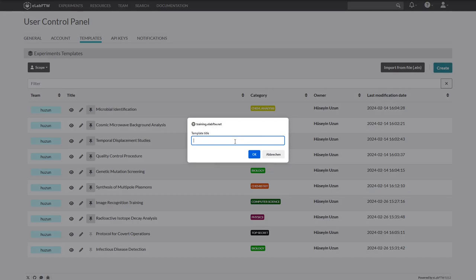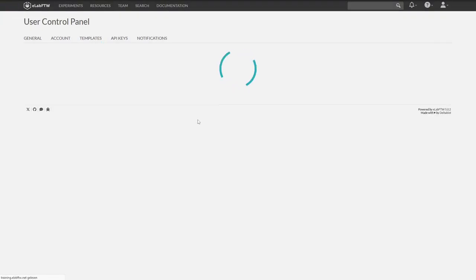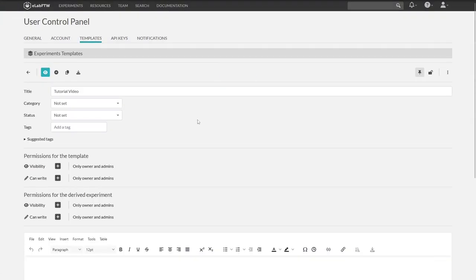Naturally it needs a title. Let's name it tutorial video. We end up directly in the editing mode and it already looks familiar to us from experiments and resources.